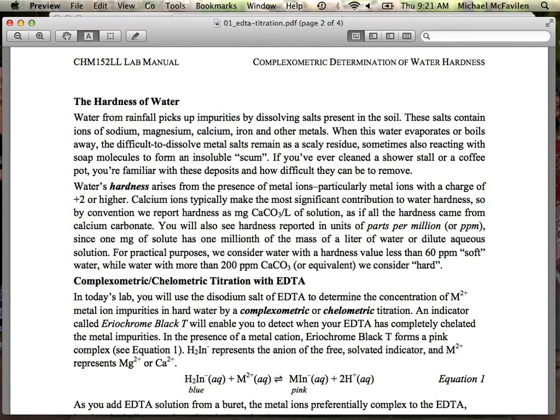Okay? Why is that something important to evaluate? Okay? Why should we look at the hardness of water? What problems does it cause? Okay? So that's ultimately your second section of what they've given to you. Okay? The next part of it is then going to start to address kind of the complexities of the hardness of water. Okay? So I think they've got it in here.